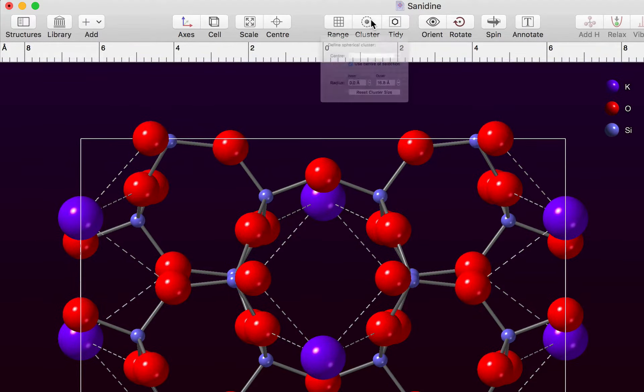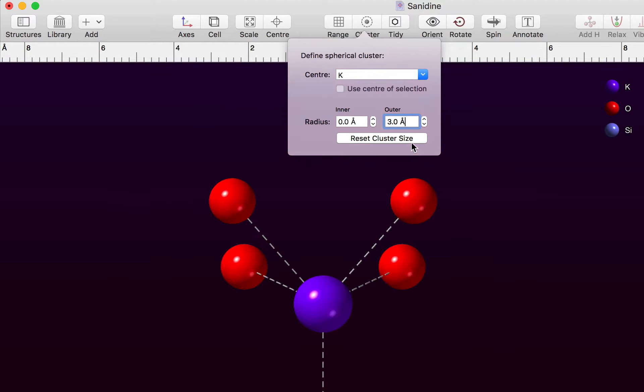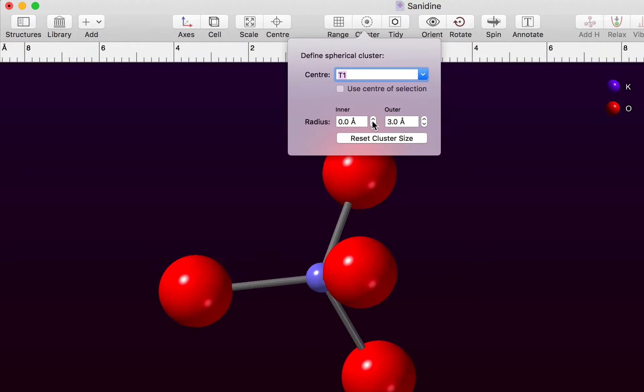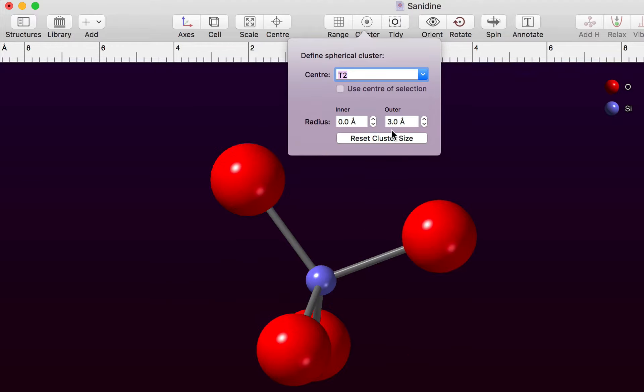So let's enter a size, let's go to three angstroms, and we can choose different sites using the combo box. We can cluster around a T1 site and a T2 site in this structure.